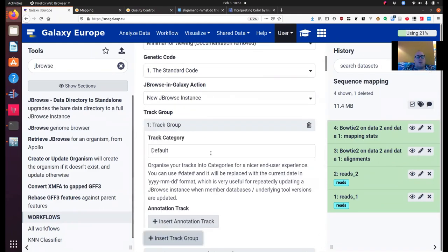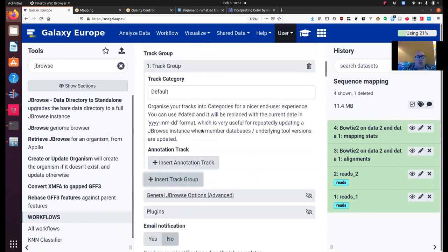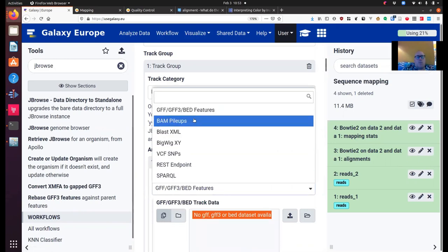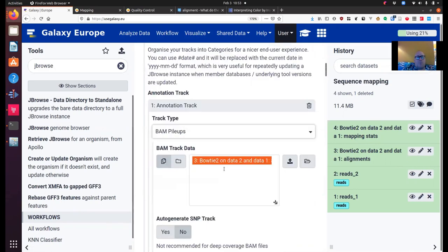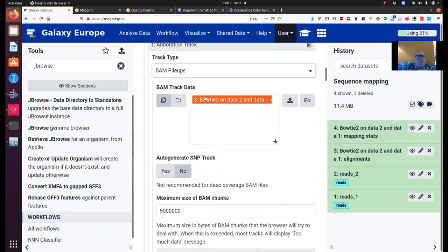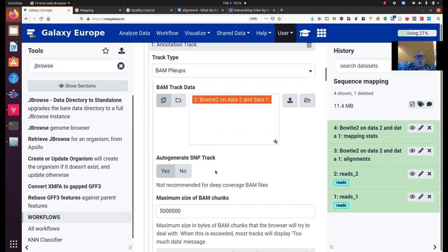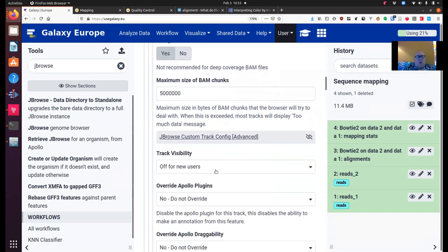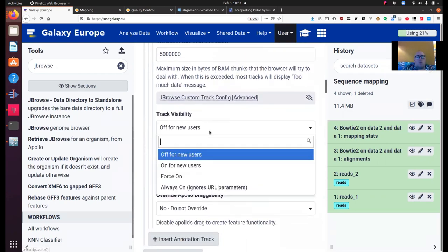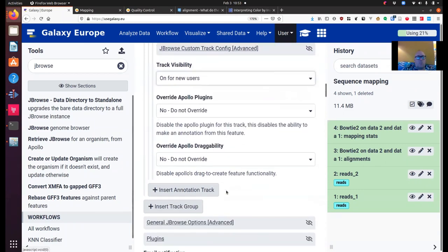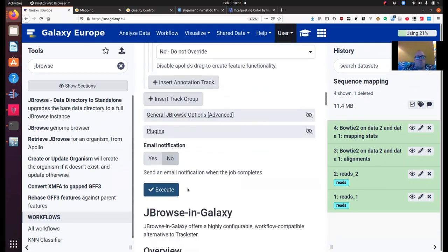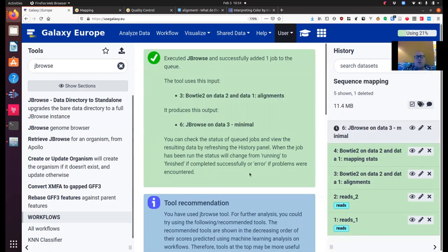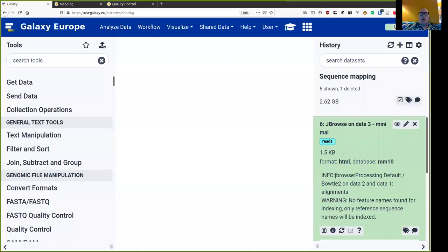And we're going to create a new JBrowse instance. We're not updating an existing one. So let's insert a track group. We can give it a name, but I'll stick with default. And I'm going to insert an annotation track from BAM pileups. So it already selects my only BAM output, which is the Bowtie2 alignment. And here I want to switch to auto-generate snip track, because I don't have a deep coverage BAM file. And I want to put the track visibility as on for new users. Now I click run. Because JBrowse is building a whole website for us, it takes a while to run.